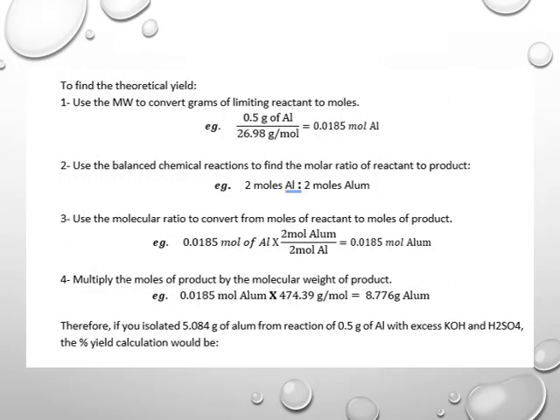هنا عندنا بعض الكالكوليشن شلون نستخرج الثيوريتيكال ييلد، تقدرون تطلعون عليها على مود تعرفون تستخرجون الثيوريتيكال ييلد، لان any synthesis لازم تستخرجون الثيوريتيكال ييلد based on this calculation. هاي كإكزامبل يعني ممكن يطبق على كل السينثيسيس، يعني بغض النظر إذا كان بوتاش ألوم أو بنزالايد أو استامينوفين whatever.